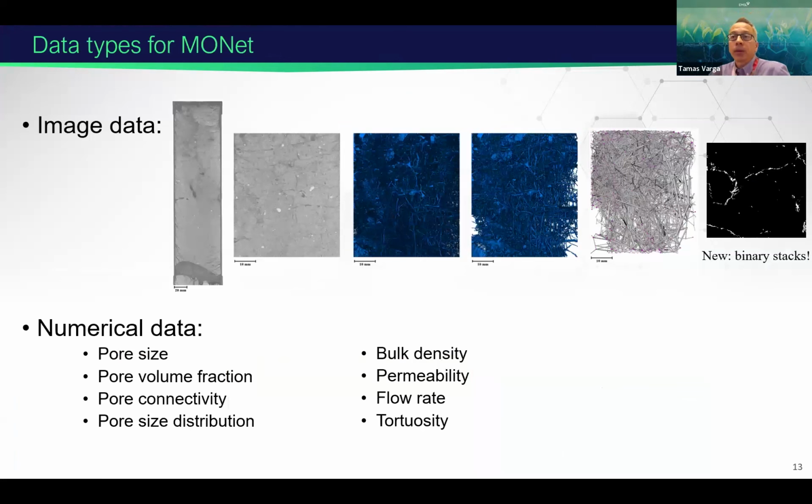And then just to summarize what's in those folders, for the image data, for the lower resolution scans we have a merged image data set, and for the higher resolution scans we have, of course, the raw grayscale data, and then those porosity images saved as individual images as well.